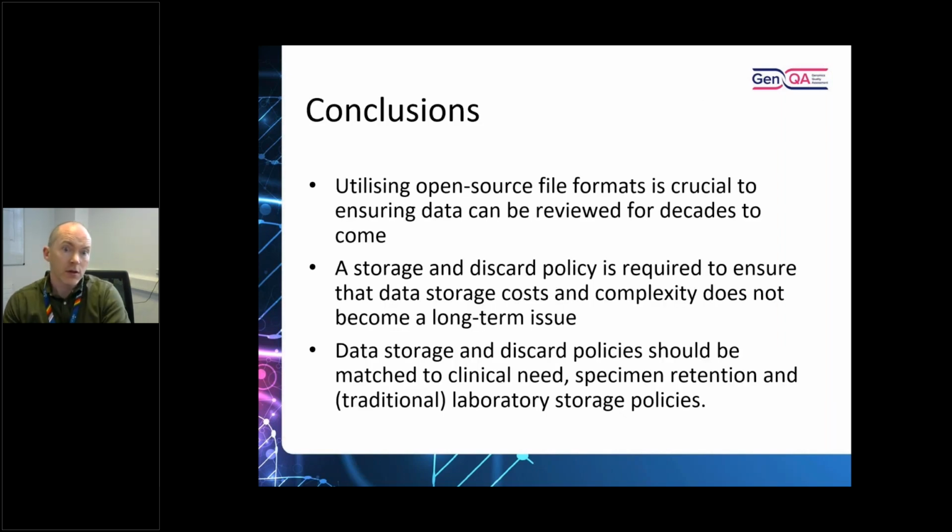So in conclusion, I think open source file formats, or file formats you can access using something like Notepad, are really important. If you get into a proprietary format, it can be very difficult to get anything back out of that. VCF is an open file format, and that's the one I would advocate most for as a minimum storage long-term and minimum cost-effective.